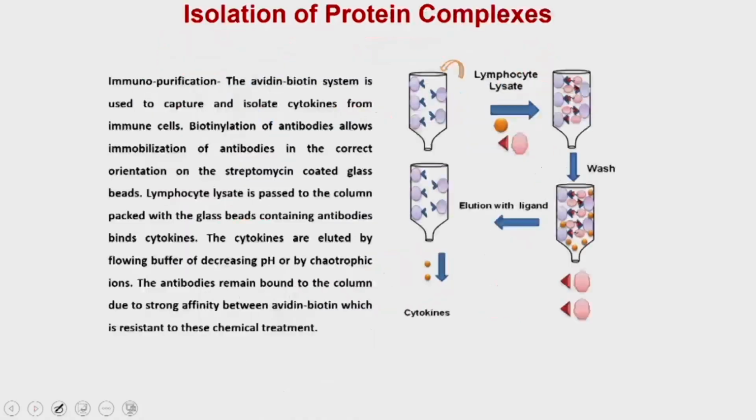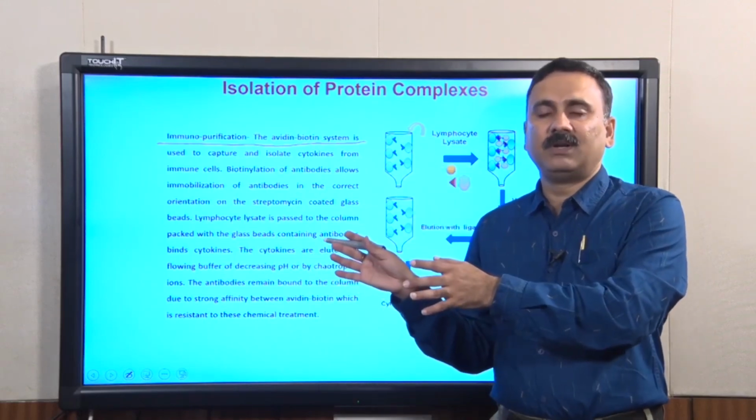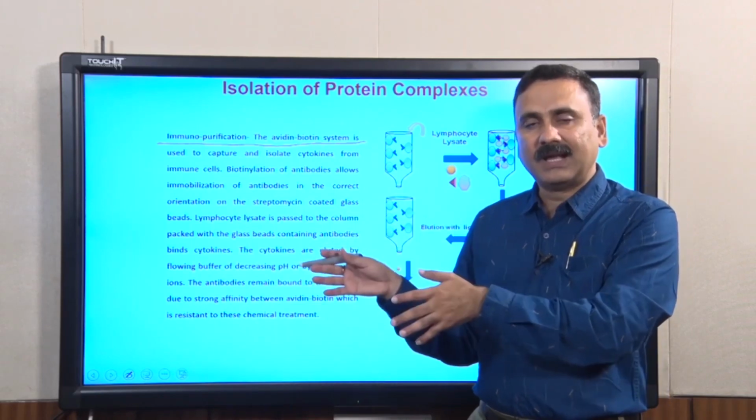The fourth is you can do immunopurification, which means you can purify the cells of your interest. This is important in cases where, suppose you would like to purify the bone marrow cells, or suppose you want to purify the stem cells and so on. In those cases, you use some affinity molecules which have exclusive affinity for that particular immune cell.